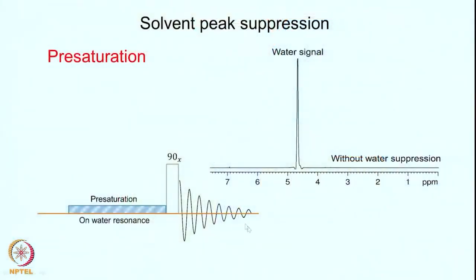Therefore, what one needs to do is to suppress the solvent peak, and that is what we are going to discuss today. Here is the spectrum of a sample which is in water — you have a huge water signal. This is a spectrum without water suppression, and you will see only the signal of the water; you do not see anything of your sample at all.